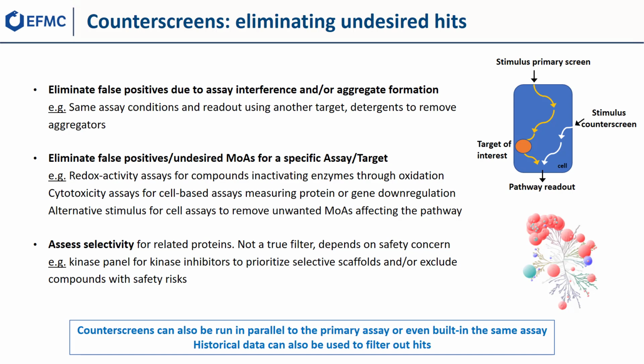So on the right side, you have a typical kinome scan tree where each end of the tree is a different kinase, and the size of these balls is the activity of the compound on a particular kinase. And when you have a profile like this one, basically hitting many kinases with very strong activity, that's probably not a compound you want to carry forward.